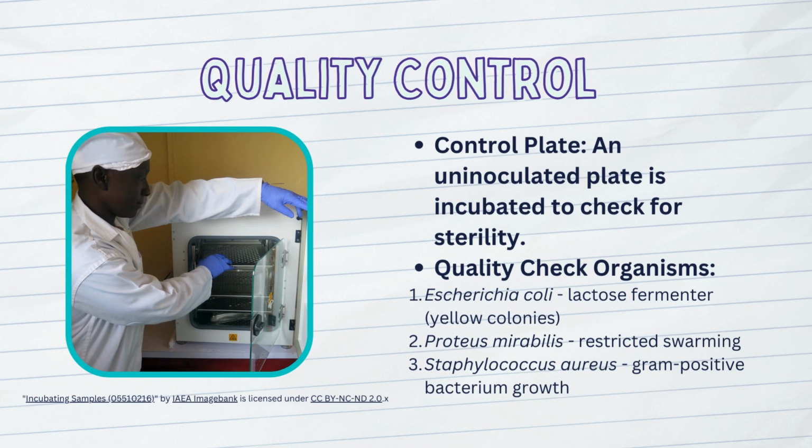Quality control. So of course, after you prepare the agar, you will have a control plate, which is an uninoculated plate that is incubated to check for sterility.